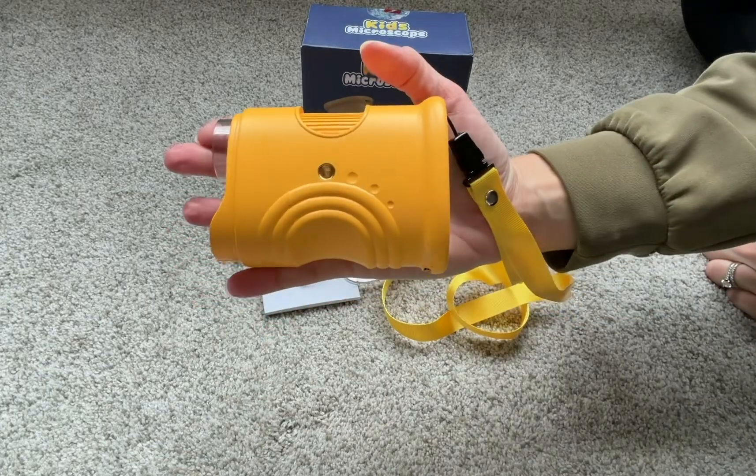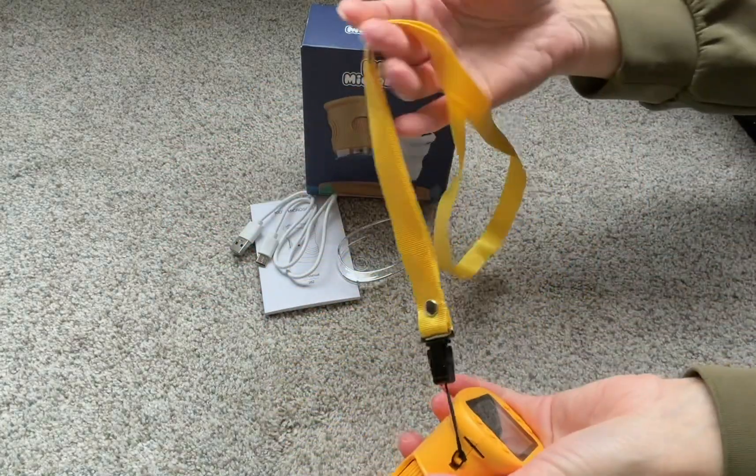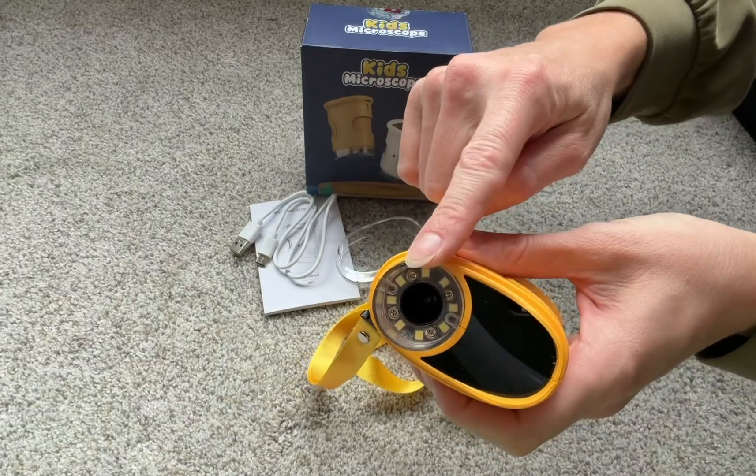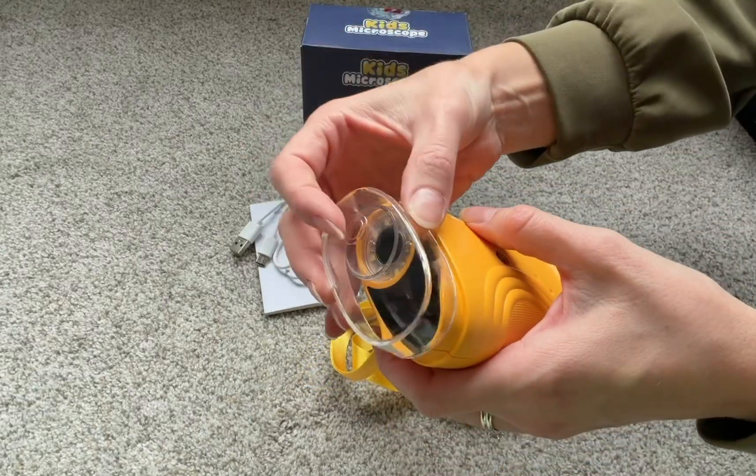It's about the size of my hand, very portable. It also comes with this nice carrying strap. This is the microscope itself — when not in use, you can cover it with this nice cap.